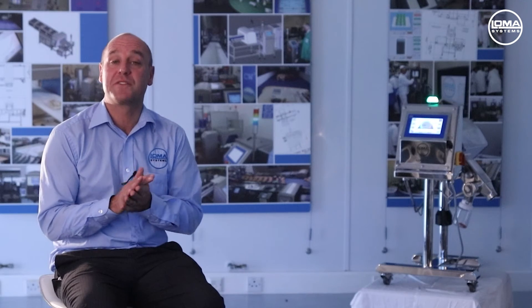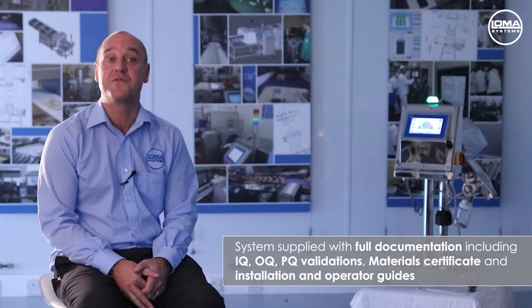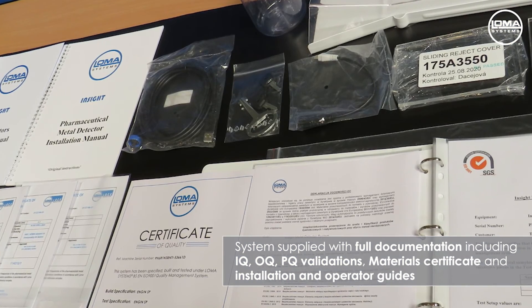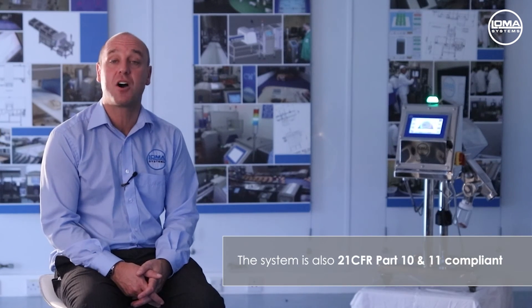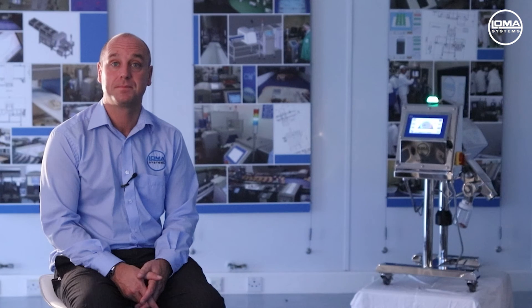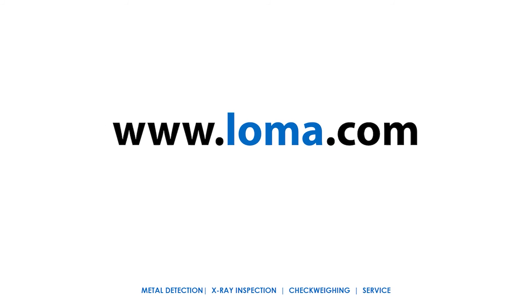The LOCPH IQ4 comes with full documentation including IQ, OQ, and PQ validations, as well as material certificates for contact parts and installation, operator, and maintenance guides. The machine can be used in a 21 CFR Part 10 and 11 manner for complete traceability. For more information on this unit, please visit our website at www.loma.com.